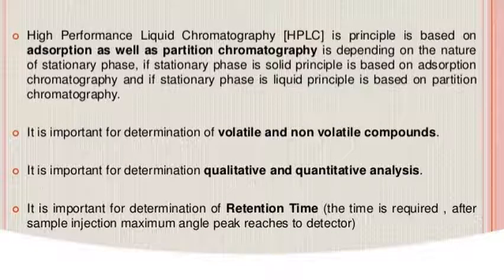What is the principle of HPLC? High performance liquid chromatography principle is based on the adsorption as well as the partition phenomena of the chromatography, depending on the nature of the stationary phase. As we all know, there are two types of chromatography and two types of principle involved on the basis of the stationary phase selected. If we choose the stationary phase solid, the principle involves adsorption, the component affinity towards the solid phase.